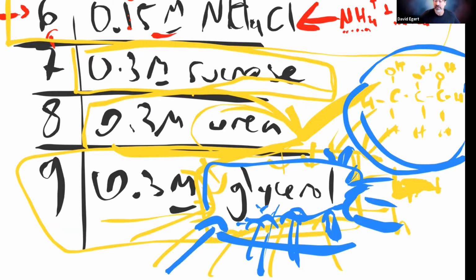So in our particular experiment with the cow blood and glycerol, it's a huge source of variability in what you're going to see there. In fact, we're turning it into a kind of secondary independent variable by actually controlling it and looking at how it affects the results in that case. So there's probably more. Those are the ones that come to the top of my head.